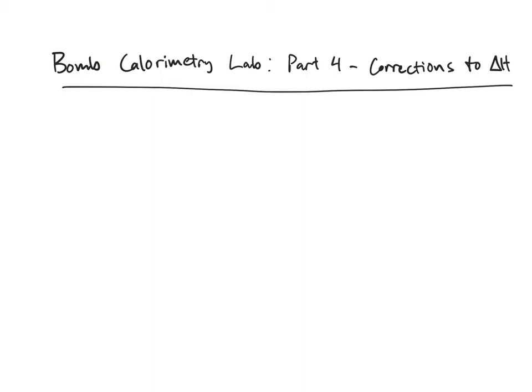In this video I'm going to show you how to find the corrections to delta H. I highly recommend referring to the protocol itself for the specific formulas, but I want to show you an example calculation, because of all the parts to the experiment, this one is one of the most confusing, as well as one of the longest and most tedious. So let's get right to it.